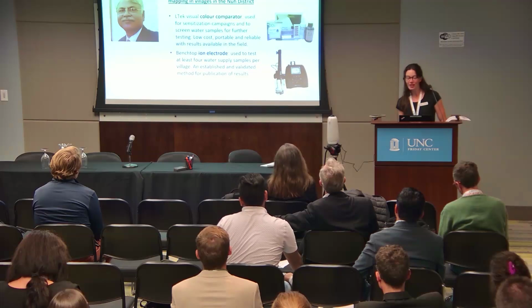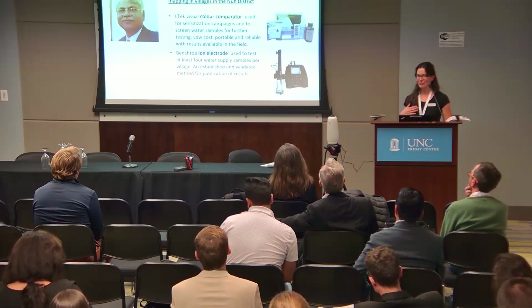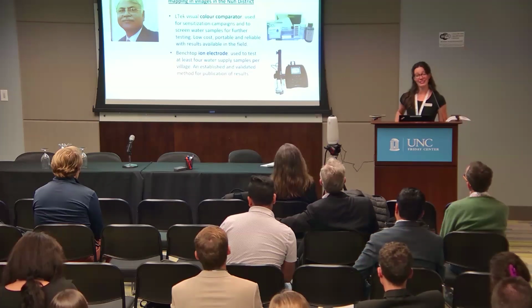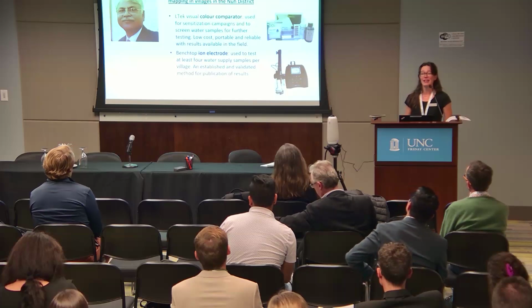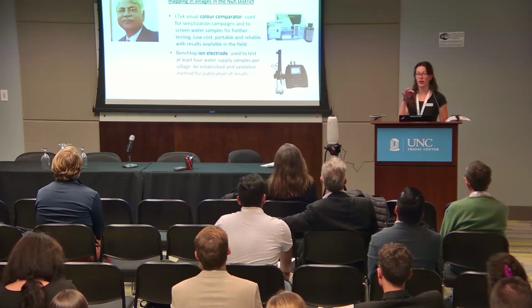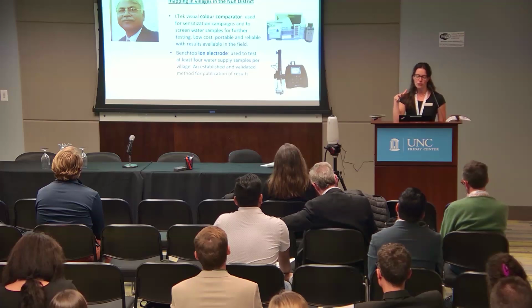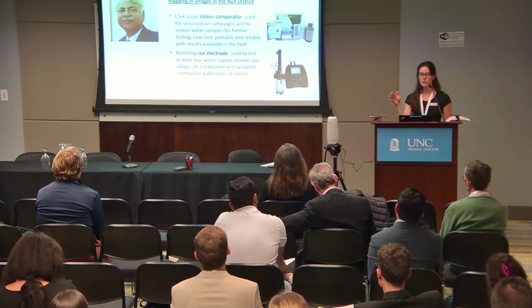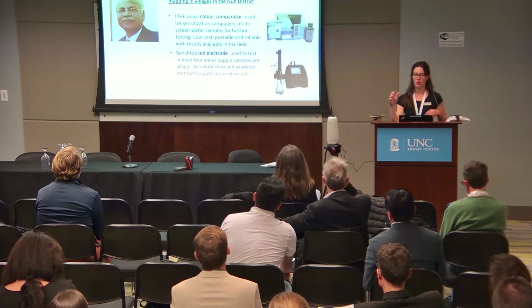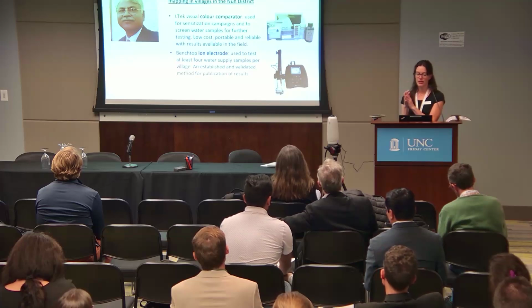I was also hoping to share the experiences of another one of our partners, Lalit, but in consideration for time, I won't show the video. I will just quickly run through his fluoride testing, because his approach was very strategic and innovative, in that they were mapping fluoride contamination of water sources and households in rural India, and they were screening the water samples using a field color comparator, so a reagent added to water to turn color, compared visually.